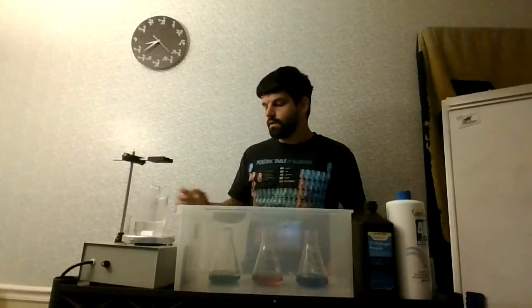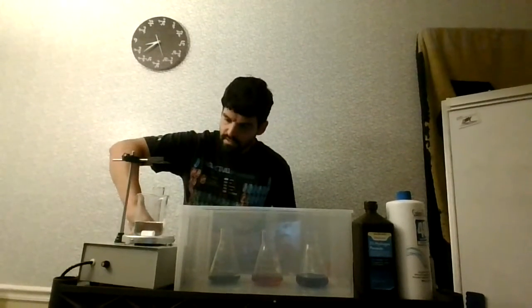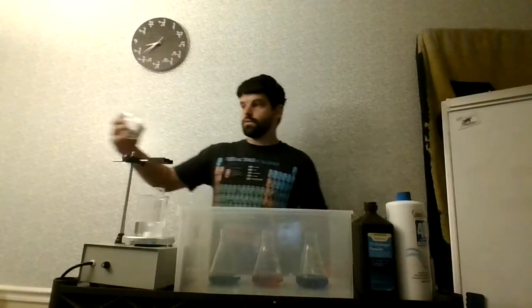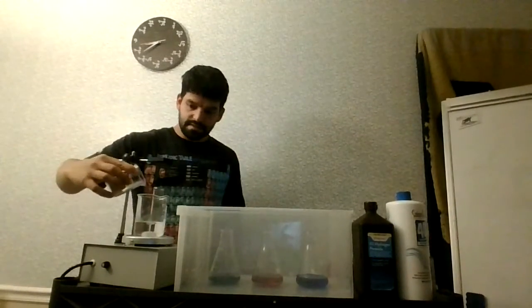Alright guys, so we are back with our hot water here. So I'm going to go ahead and start with the stirrer. I'm going to be adding 2 packets of yeast here because I'm doing 2 basic experiments. So again, what you're looking for with this is you want it to be as least viscous as possible.